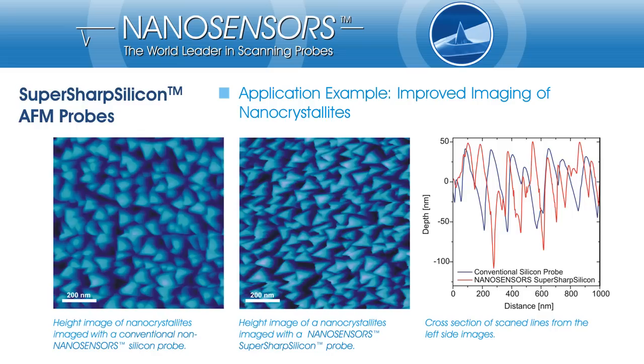Here we can see two high-resolution images of the same nanocrystallite sample — once imaged with a standard silicon probe on the left side and a NanoSensors SuperSharp Silicon probe in the middle. The two AFM images have the same height scaling. It can be seen easily that the nanocrystallites appear much sharper on the right-hand side AFM image, and the topography is more distinctive than on the left image. Looking at the cross-section view of scanned lines, it can be seen that the edges and ridges of the nanocrystallites imaged with a SuperSharp Silicon tip have by far smaller edge radius compared to a conventional silicon probe.